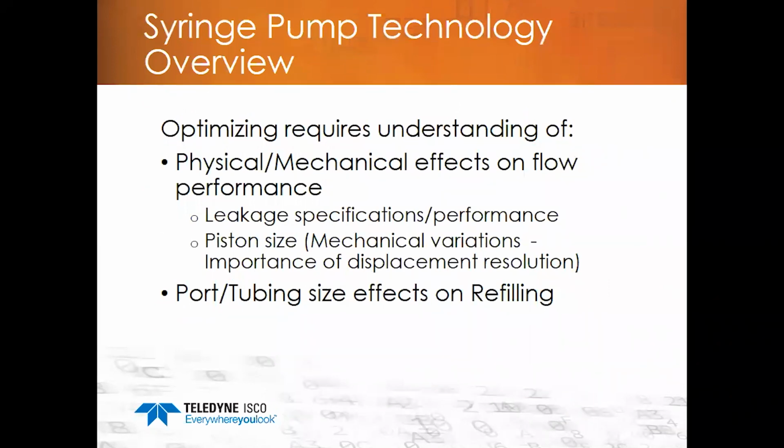A pump technology overview for optimizing requires an understanding of the physical and mechanical effects of flow performance, such as pump model selection, leakage specifications and performance, the piston size, where mechanical variations and the importance of displacement resolution, the port sizes or tubing sizes and their effects in refilling.